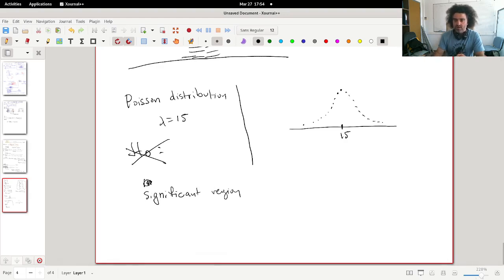In this way, we might classify each region of these 500 base pairs. So this is one region, this is another region, next to that, next to that, as either significant, and let's use the number 1 for that, or non-significant, let's use the number 0 for that.